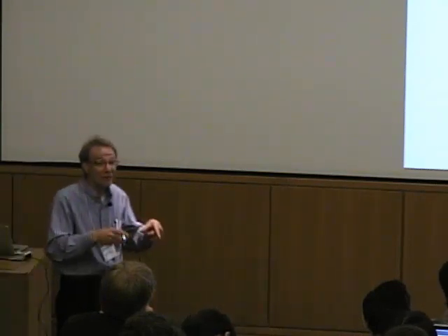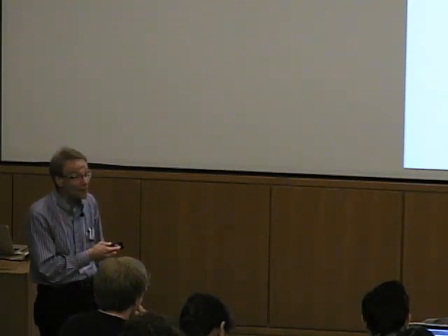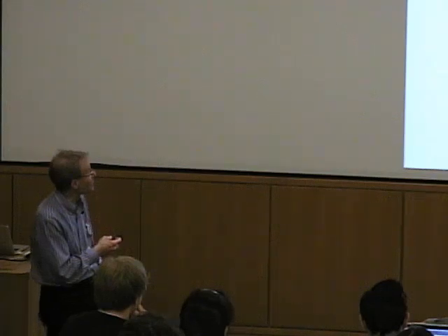The choice of the buffer can be really important, not only for maintaining pH, but the buffer-metal interaction can suppress side reactions, like this hydrolysis. If you have a well-defined metal complex you're delivering, it can suppress side reactions and give you more accurate data. It can provide a competing ligand for the metal. We'll see how we can use that. But you need to know the metal-buffer interactions.